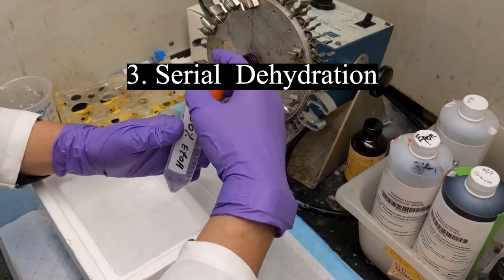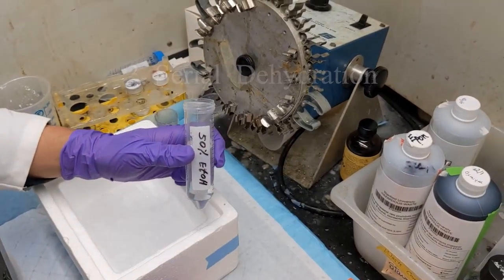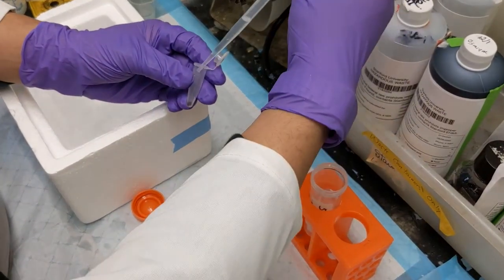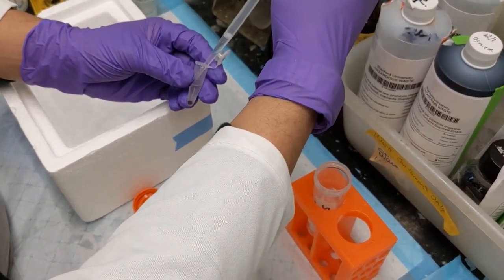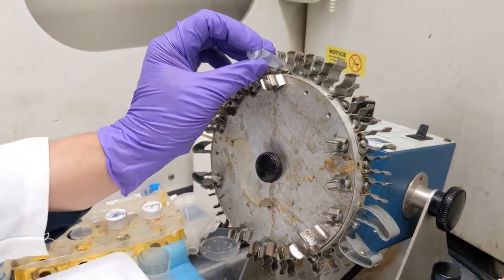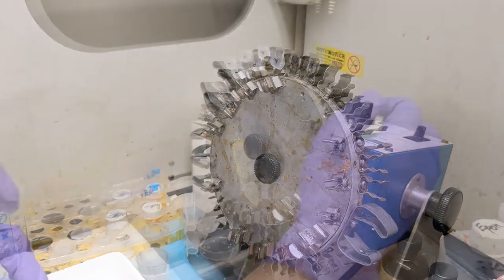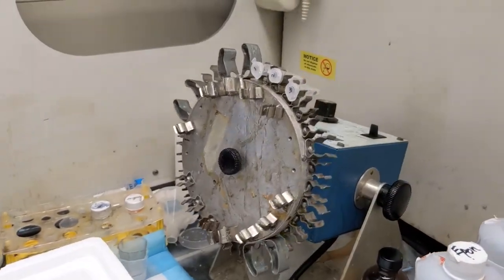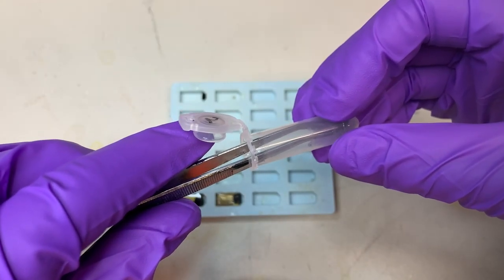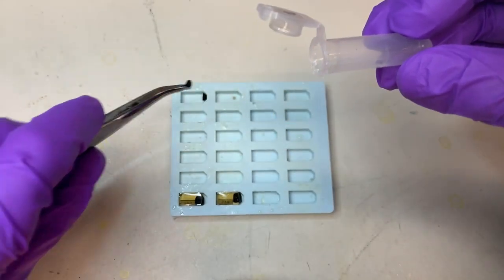The tissue sample is then dehydrated using increasing concentrations of ethanol. The epoxy resin used for embedding is highly water insoluble, so all water must be drawn out of the tissue. Once dehydrated, the ethanol is replaced with propylene oxide as it more thoroughly evaporates and can be removed from the sample more completely during infiltration.